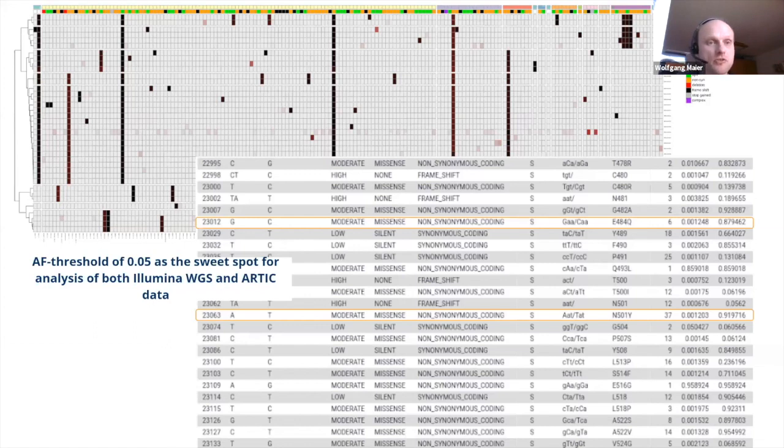And this can be used for several things. First of all, it visually groups similar samples together, as you can see. So you can very quickly see what this roughly corresponds to, though not always exactly, Nextstrain clades. You can quickly see what kind of lineages you might have in this data, key positions that are signature mutations of lineages. They should typically be black here and shared by many samples. You also see low frequency variants that you would typically not see in consensus sequences in light colors.